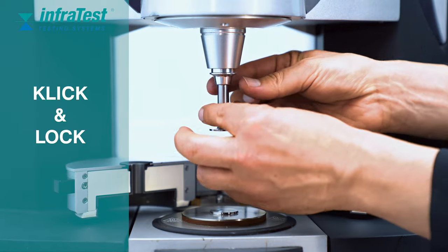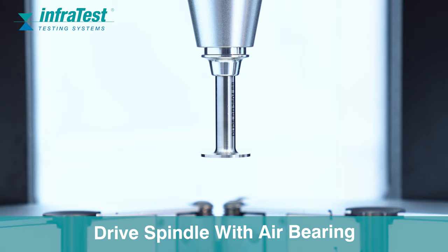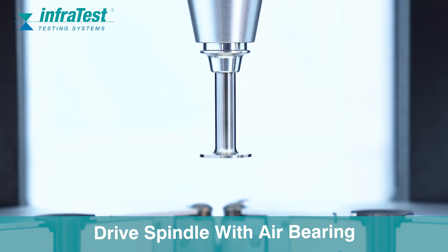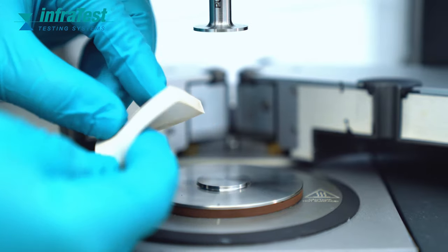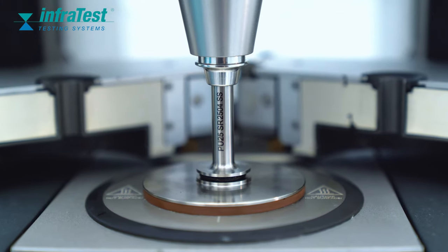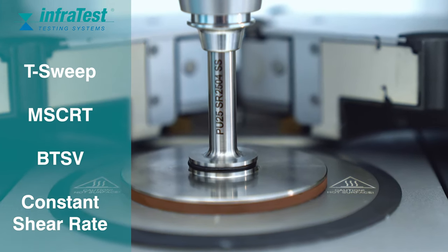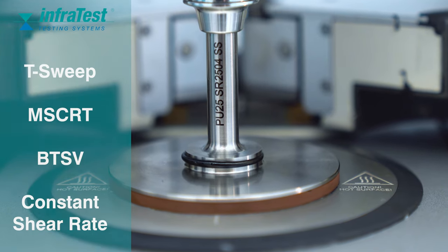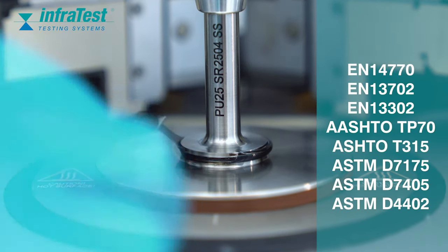We need to insert the geometry into our quick coupling. We are placing a sample between an upper and a lower plate at a distance of 1 mm. The diameter of the upper plate can vary between 4 mm, 8 mm, and 25 mm, depending on the stiffness of the binder and the temperature range we want to investigate.